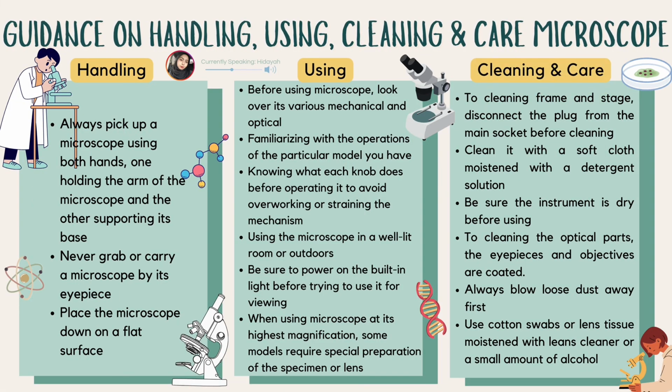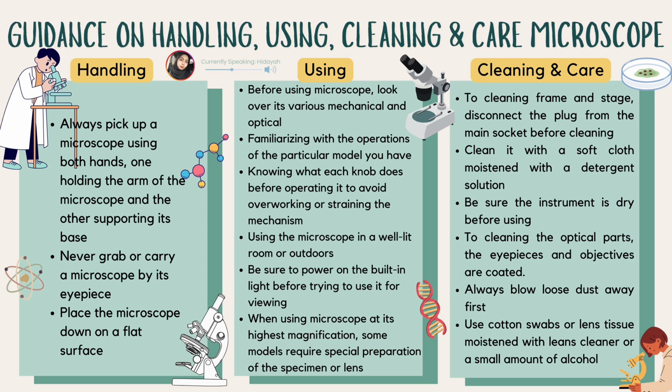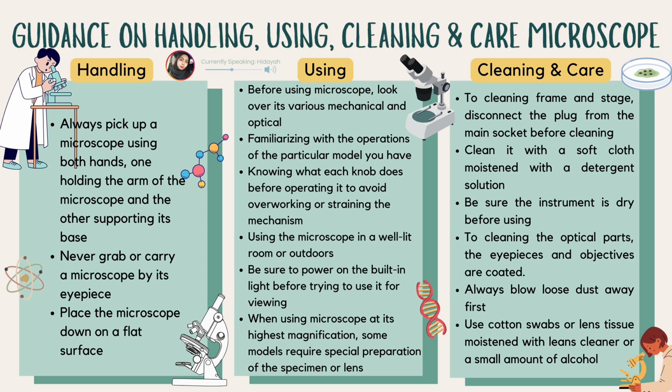When handling a microscope, always pick it up using both hands, one holding the arm and the other supporting the base. Never grab or carry a microscope by its eyepiece. Place the microscope on a flat, stable surface. Before using the microscope, familiarize yourself with its various mechanical and optical components.